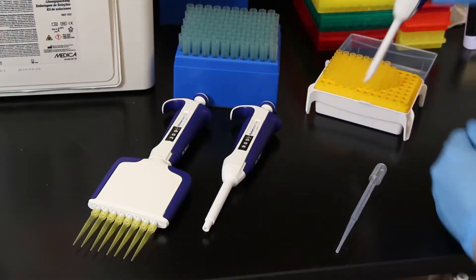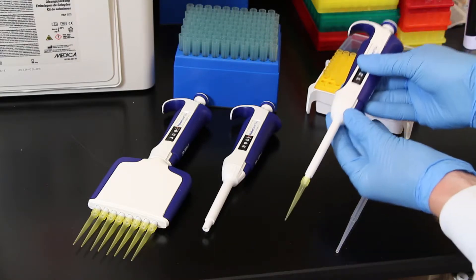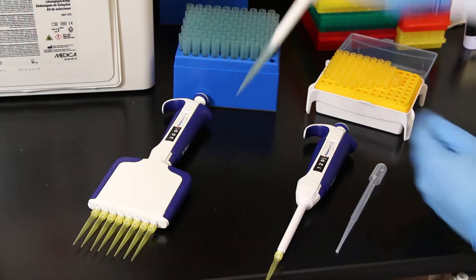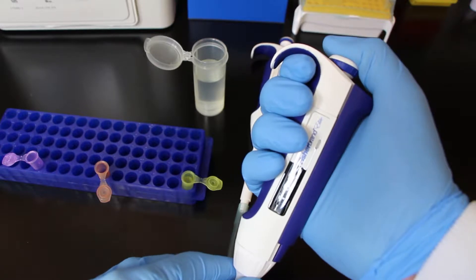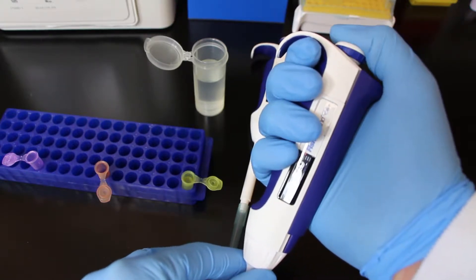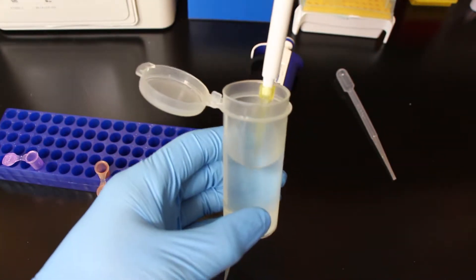Once you adjust to the volume you want, you take the pipette and push it down into a pipette tip that's appropriate for the size of that pipette — you're going to notice there are different size tips. We're going to use yellow ones, which are smaller, and blue ones, which are larger in this video. You're going to notice there are two different clicking points for the button on top that you're going to use to suck up the solution. When you push the button down to the first click, that is the click you're going to use when you're trying to suck up.